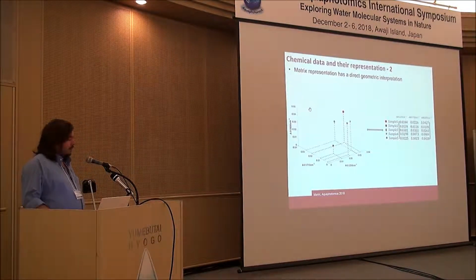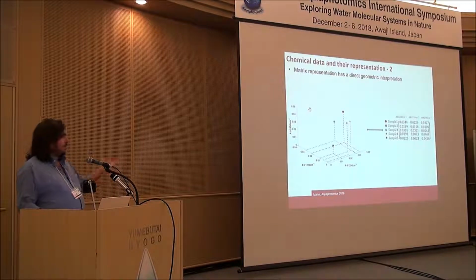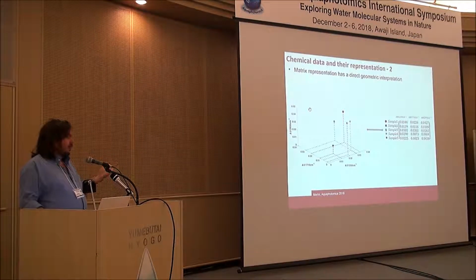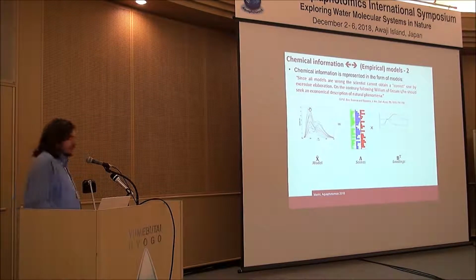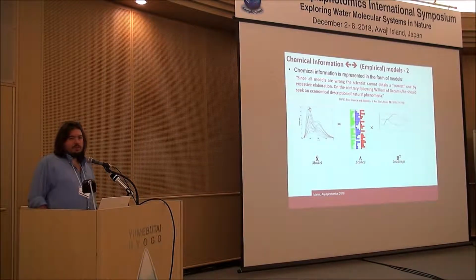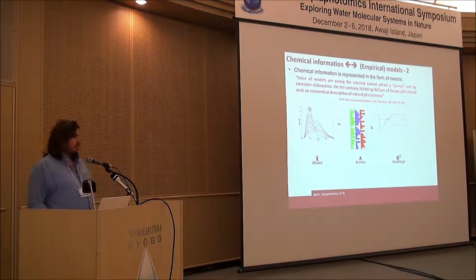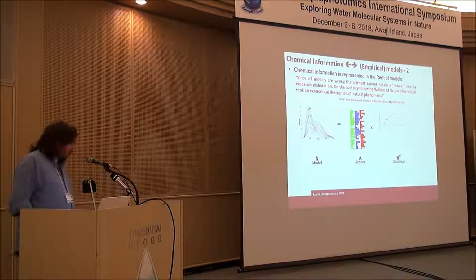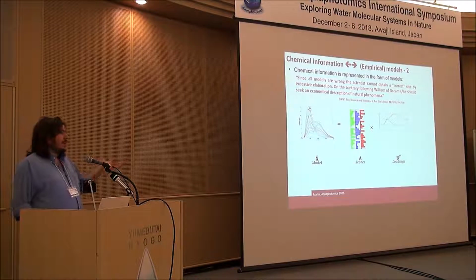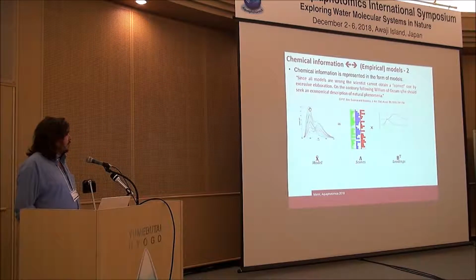And of course, when we have hundreds or thousands of variables describing our data, using directly the spectroscopic data for such a representation becomes unfeasible. And we need models. We need models to encode the information that is present in the data. In general, not only for the representational part, and we will describe much of these models, information in chemometrics is encoded, in an approximate way, in the form of models.